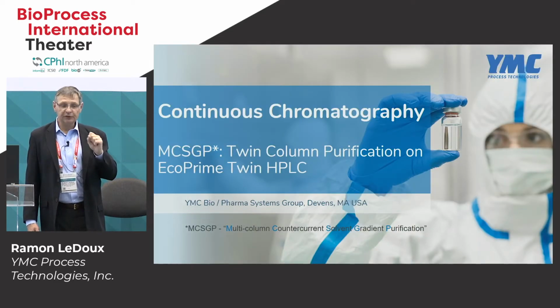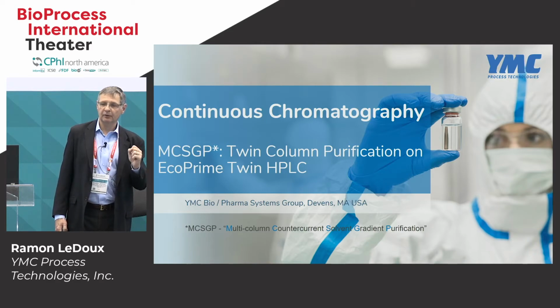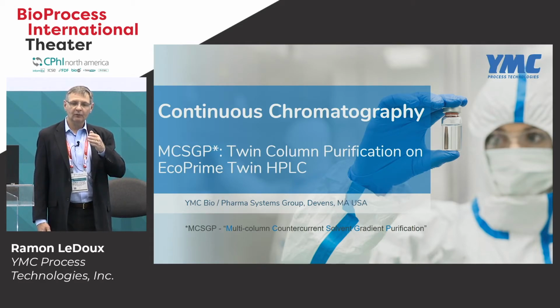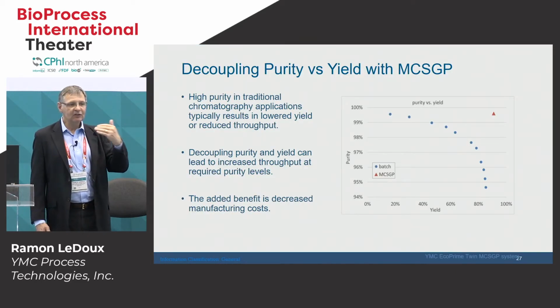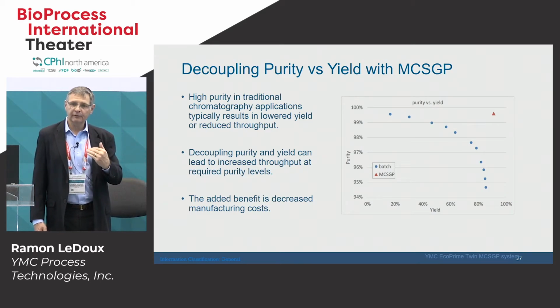Now I'm going to switch gears a little bit, and I'm going to talk about a small molecule, a peptide purification. This is run on a synthetic peptide, and it's quite a bit of a different process than what we just talked about. So I'm going to show you a quick illustration of how that works. But if we think about, again, decoupling that purity recovery curve, that's our focus here.